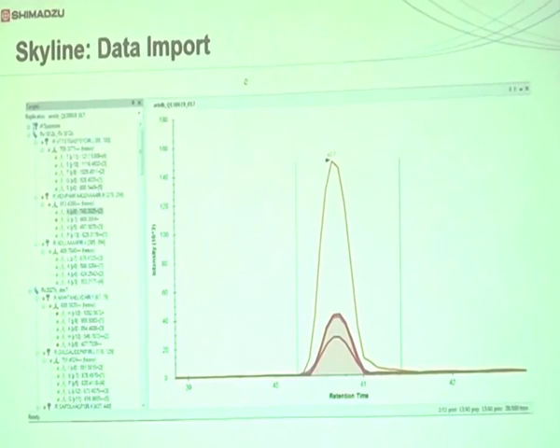For a given peptide, if all the transitions which are generated by Skyline show positive results, then that peptide will appear in green color. Suppose any of the transitions has not generated any response but the remaining others are generating a response, then that peptide will appear yellow in color. If none of the transitions has generated a response, then that peptide will give a red signal.